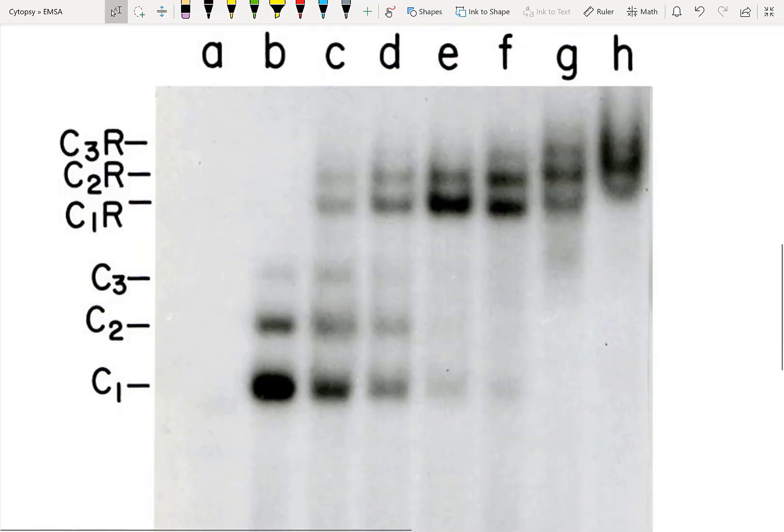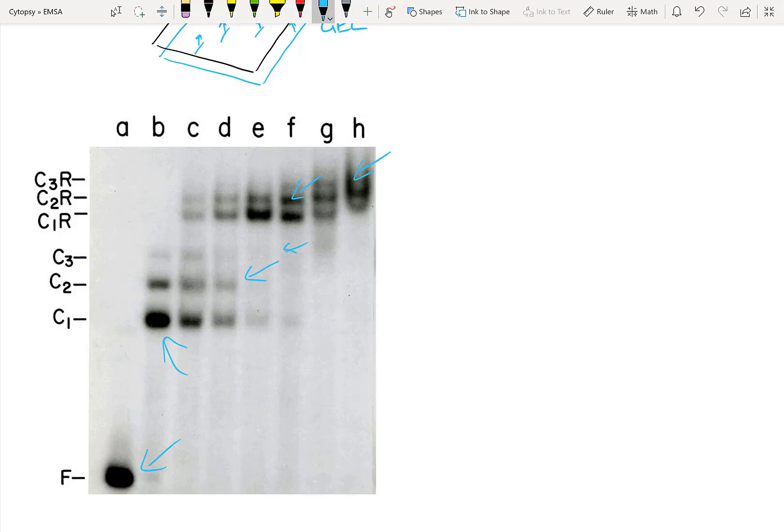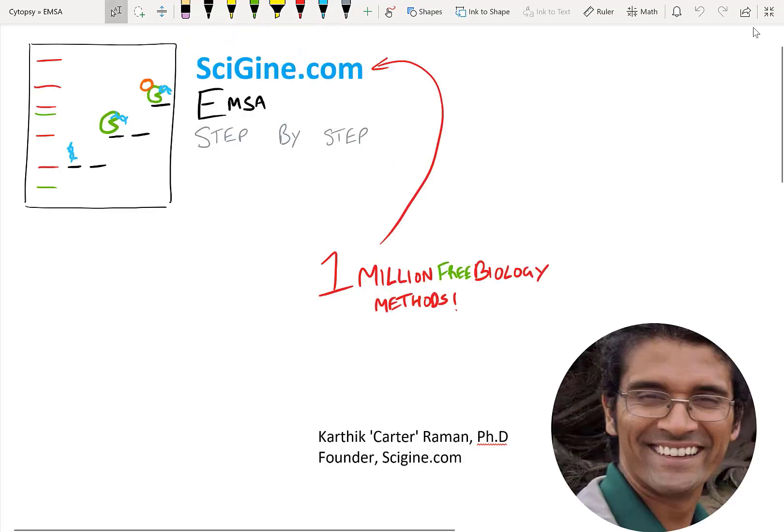At the end, you should get data that looks something like this. Here you can see that we've got free DNA at the bottom, some kind of DNA complex that's shown up here, and then super complexes of multiple proteins or different complexes of proteins binding the DNA and forming bigger and bigger complexes that have a bigger and bigger electrophoretic mobility shift within our EMSA. And that's about it.